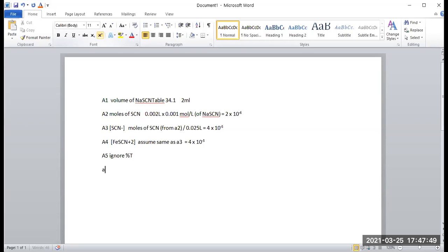And then A6, this is your absorbance values. They should be somewhere between 0.001 and 2, well, technically 1.999. Remember that they should have been increasing as you went across. That way, it will give you a nice, relatively linear graph by the time you actually create your graph.